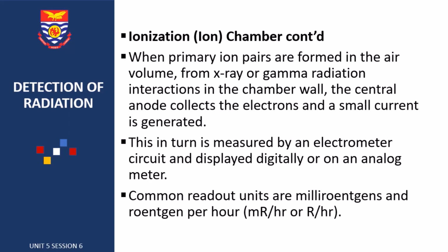This in turn is measured by an electrometer and it is displayed digitally or on an analog meter.